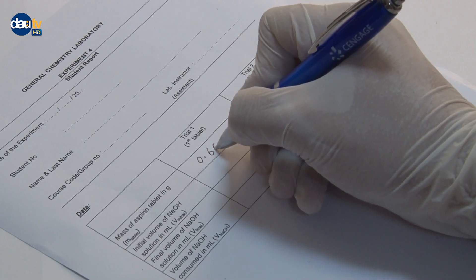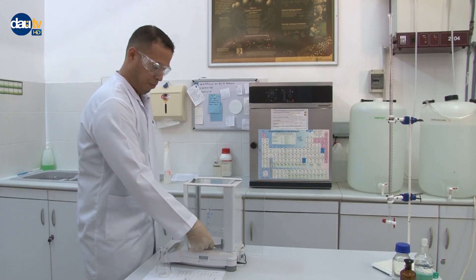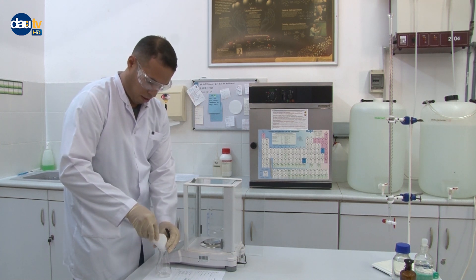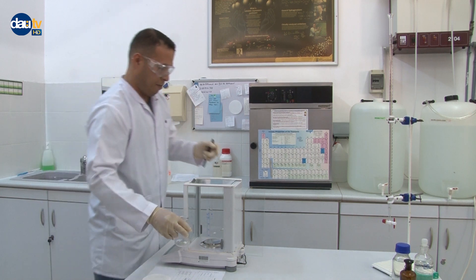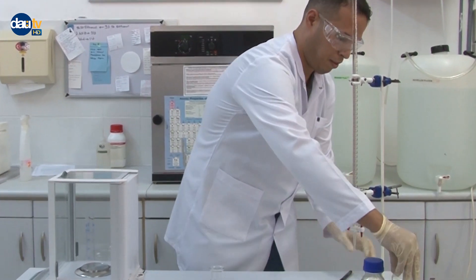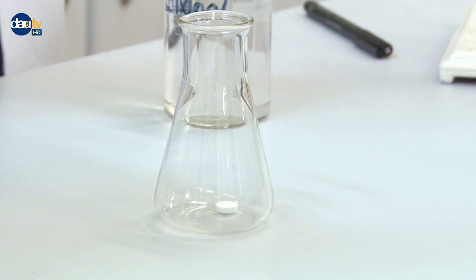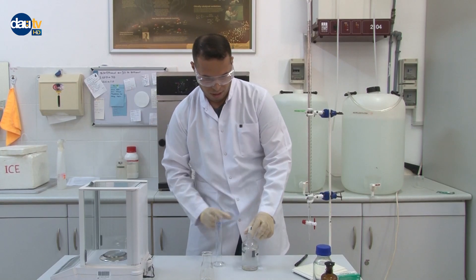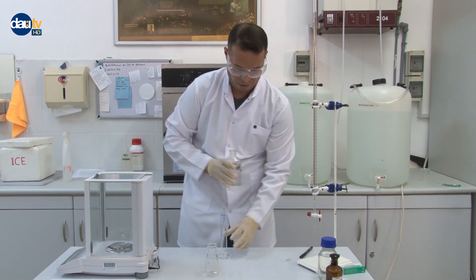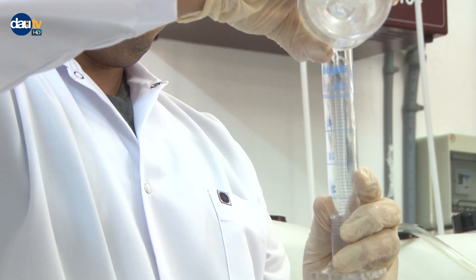Record the weight. Place the tablet into a 250 milliliters Erlenmeyer flask. Obtain about 50 milliliters of 50% ethanol solution.